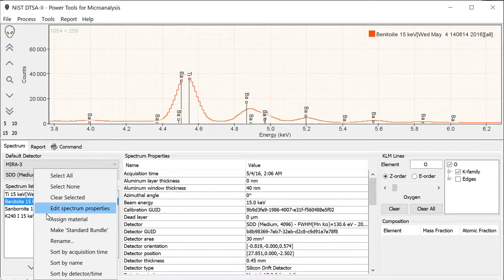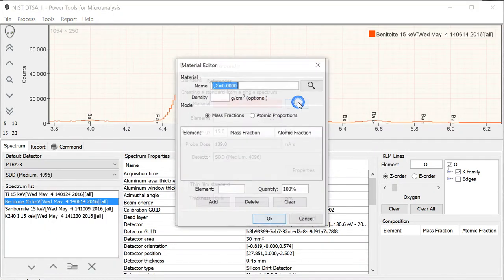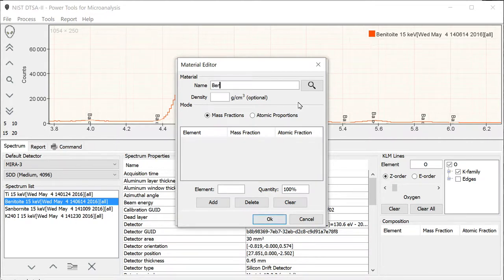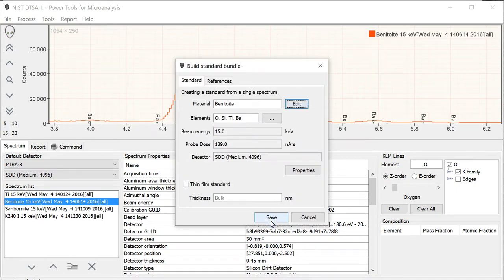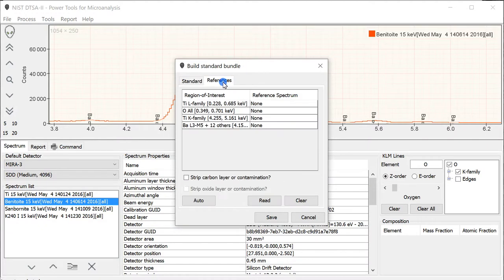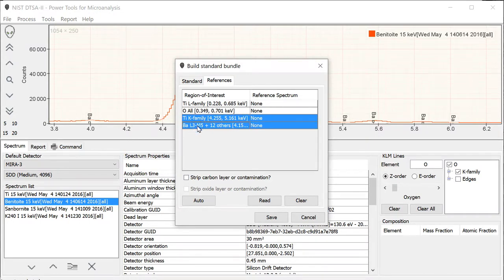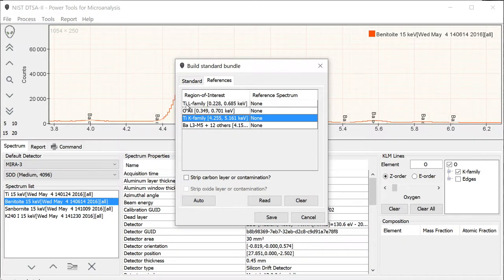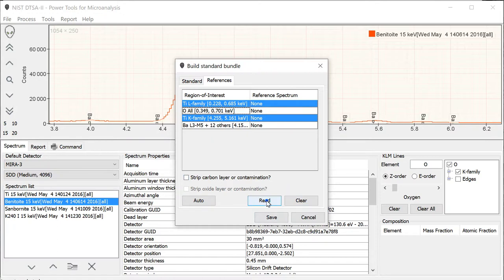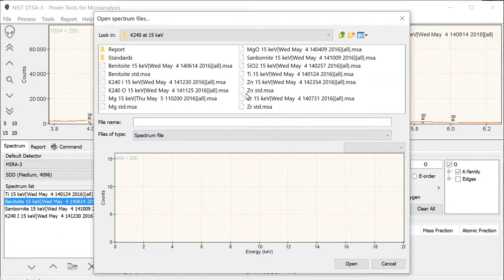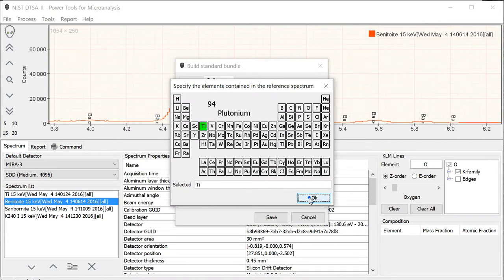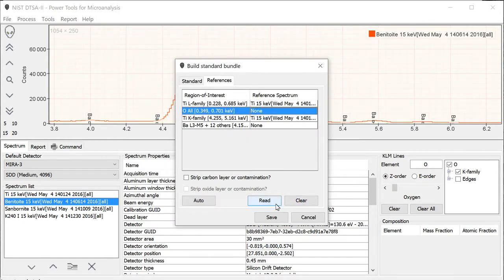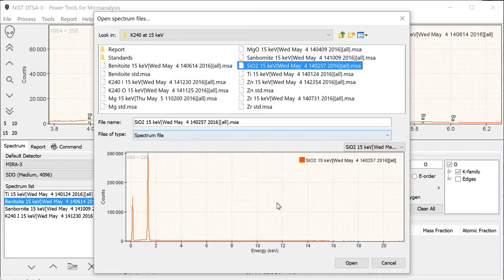One quick way is to go to the standard bundle, make a standard bundle, and if you specify what the material is—benitoite is in the database so we don't need to redefine it—it will tell you on the second page here under references what references are required. As we discussed, titanium K family and the barium L family references are needed. But also, it turns out that there's an interference between the titanium L and oxygen K families. So we could read in a titanium reference for this, and an oxygen reference. I'm going to use SiO2 because the oxygen is well separated from the silicon, so there's no risk of an interference there.